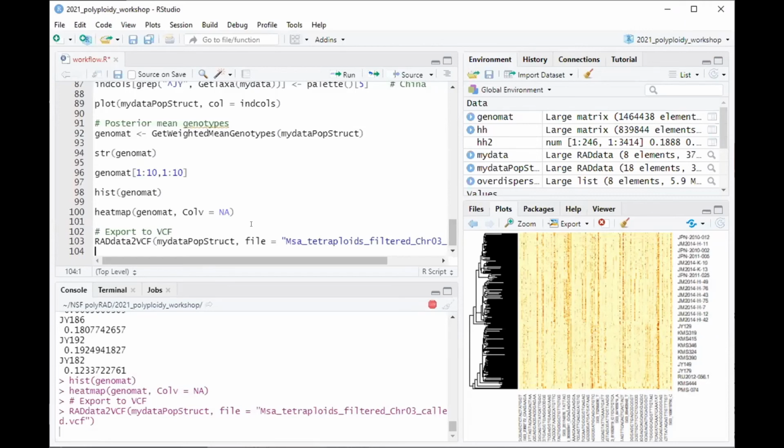Yes, Lindsay, there's one here. Prior probabilities are not usually inferred from data in Bayesian models, as far as the question understands. So the question is, do you risk propagating errors by using the data to infer the prior probabilities from PCs on each individual? I guess you do, but I don't know where else you would get the prior probabilities if you didn't get them from the sequencing data. Are you going to do a whole separate experiment to get allele frequencies at every locus across the genome before you run this experiment to do the genotyping?